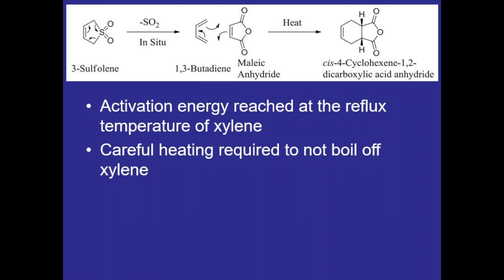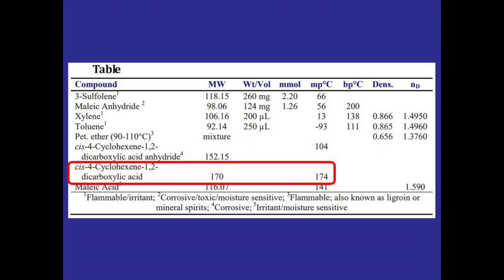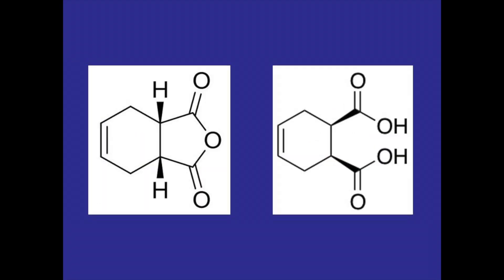But we need to be careful not to get it too hot because if we boil off too much xylene, the reaction vessel will heat up and that'll create contamination where the product actually starts to decompose into a dicarboxylic acid instead of an anhydride as shown here in the table. So the anhydride product that we want is shown here on the left but we can see the dicarboxylic acid contamination if we allow it to get too hot.